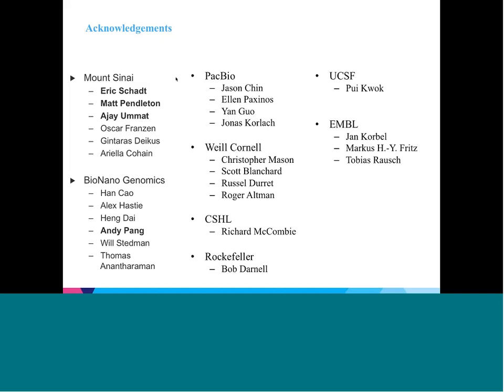What you can say about whether you can drop the coverage of PacBio is just that, as their QV improves and read length improves, you may then be able to start doing that. So it's going to be you tracking the improvements in single molecule, single base sequencing on the PacBio side versus the length that you're getting from BioNano. But using BioNano in general definitely doesn't mean that you then have to go to 100x on the PacBio side.